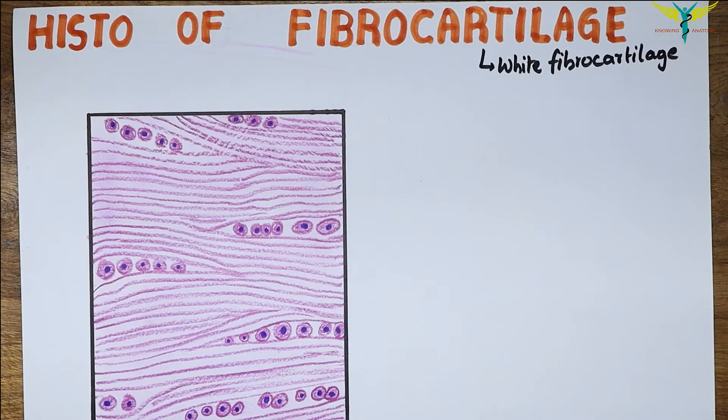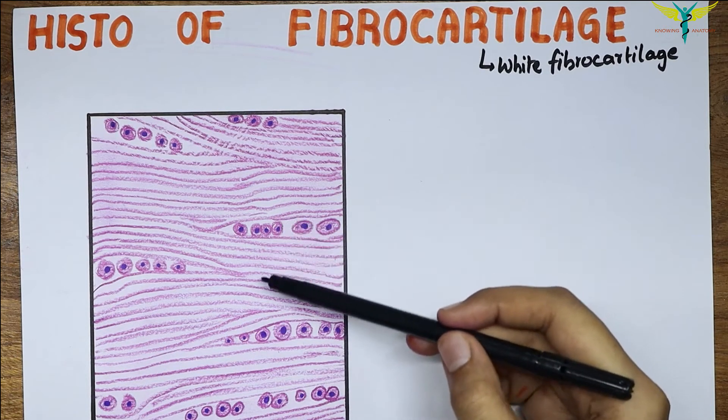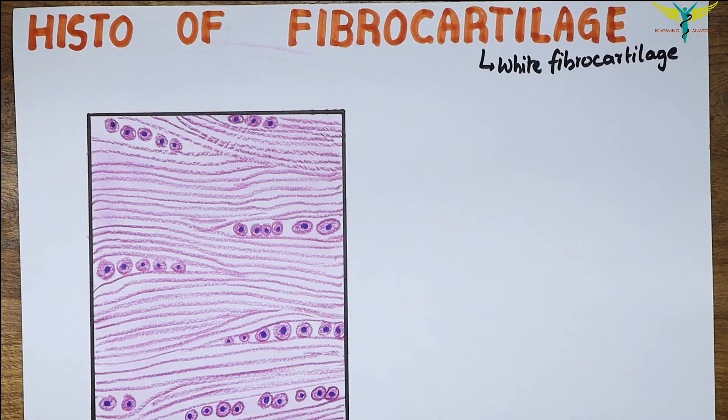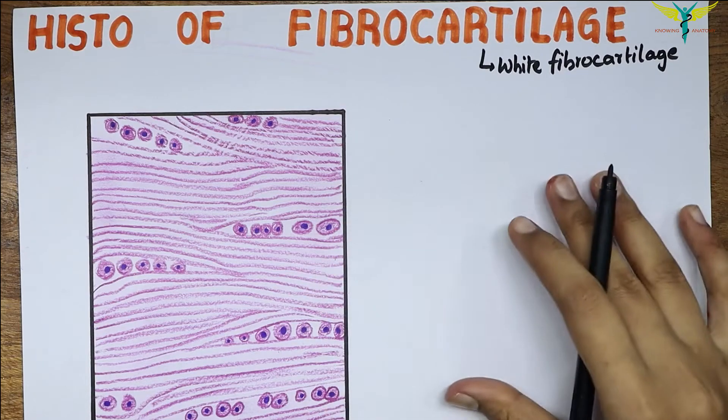In sections, this cartilage contains typical cartilaginous cells that are surrounded by capsules. The matrix contains numerous collagen bundles amongst which few chondrocytes are present. These fibers merge with surrounding connective tissue.